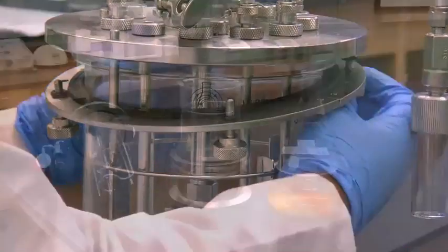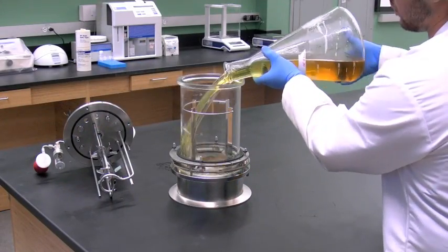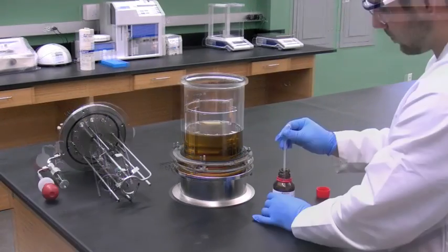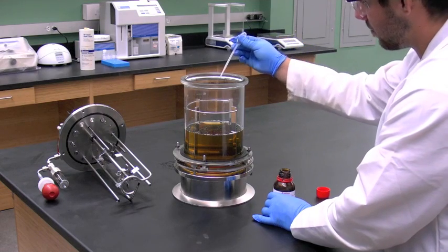Remove the head plate by loosening the screws and empty the flask of medium solution into the fermenter. Add two drops of anti-foam.